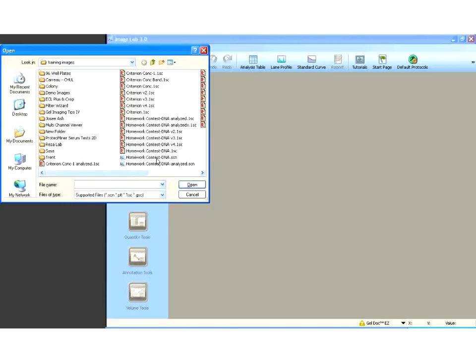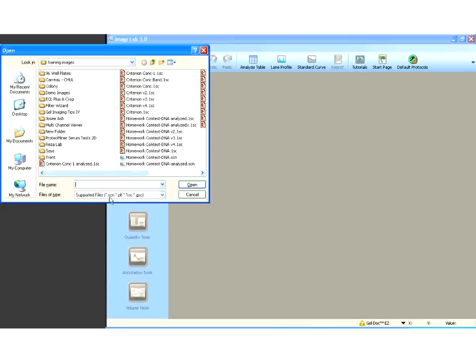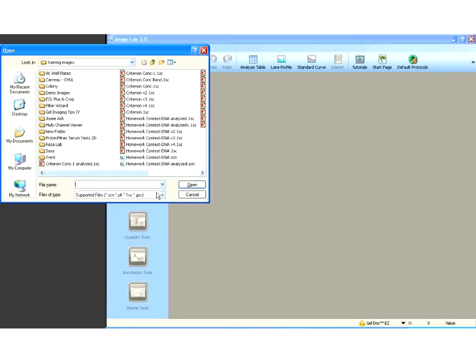This software is great because it opens either Quantity One files, .1sc files, or scan files, which are from Image Lab. The fact that it opens Quantity One files means that you're actually able to open files that are run on our GelDocs, our Chemidocs, our VersaDocs, and our Pharos FX instruments.